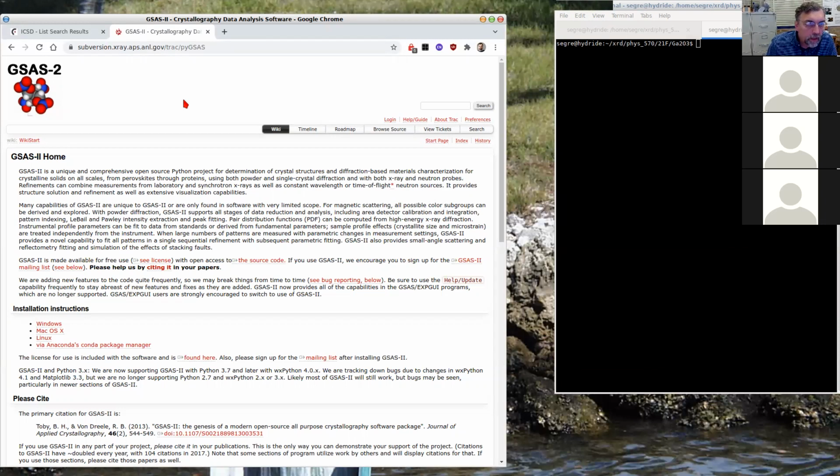The program is called GSAS-II, and that's General Structure Analysis System, and it can do single crystal and powder diffraction. It can do some amount of structure solution, so unknown structures.